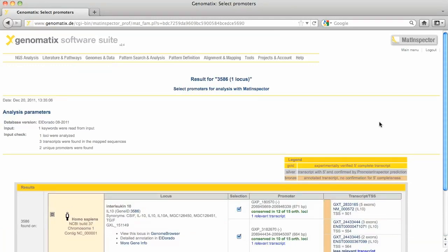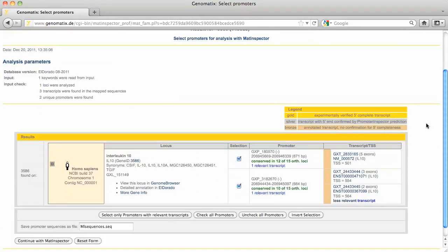The next page gives you a list of the annotated promoters for IL-10. You can select and deselect them here for the analysis. For this example I leave both selected and continue.